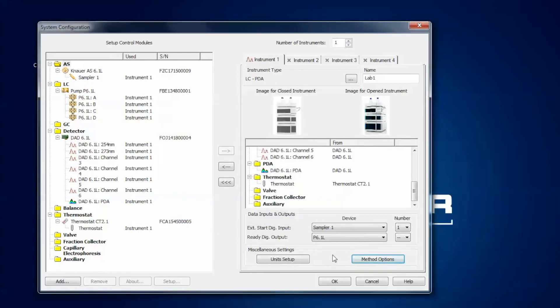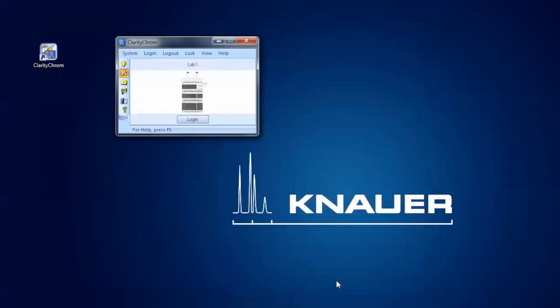With this the instrument is finally configured. You can name the instrument individually — in my case I type in 'analytical system'. You can then close the configuration window and start to open the instrument and write your method.